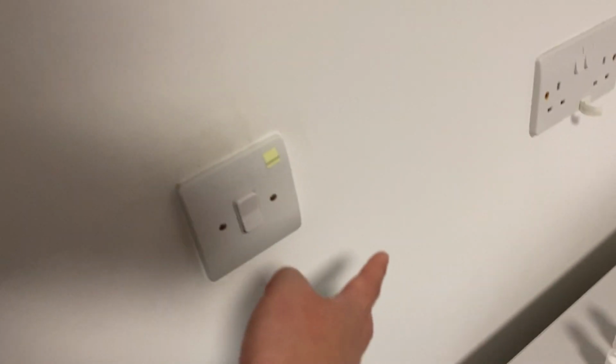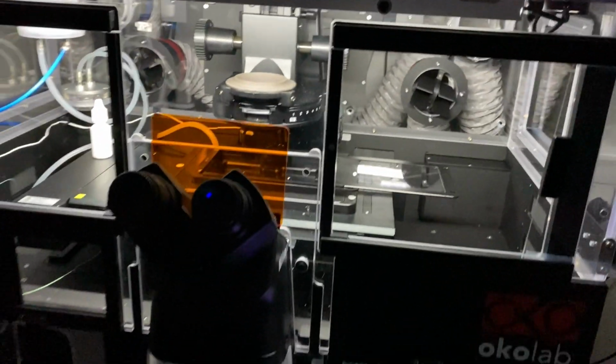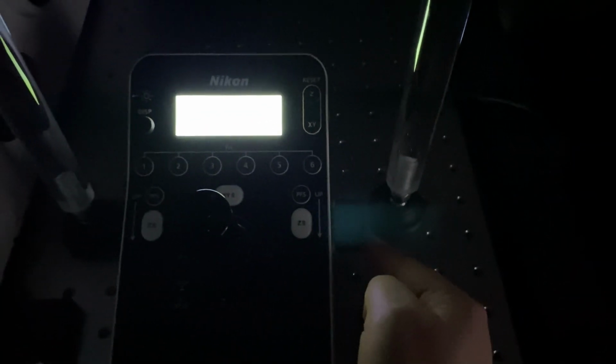You want to switch off the room light, so it's just down once. And you also want to switch off the box light, so it's just the paddle on the floor. And now you are ready to look down the eyepiece and bring your lens upwards. So put your finger on the side of the wheel, like this, and you want to move the wheel towards you.